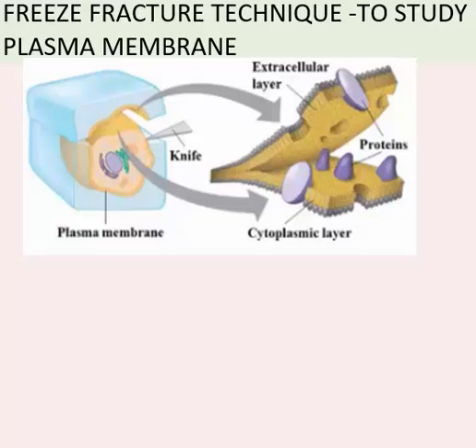Hello, this is Suman, and today's topic is Freeze fracture technique. It is a technique to study the plasma membrane, particularly to visualize what is inside the membrane. So let's begin. The name is Freeze fracture technique.